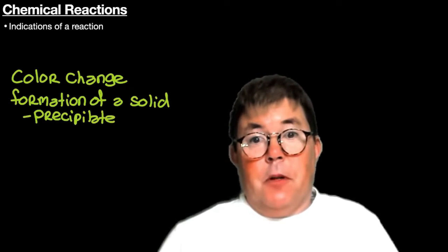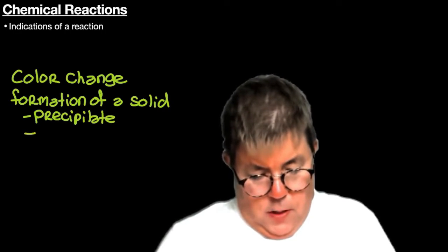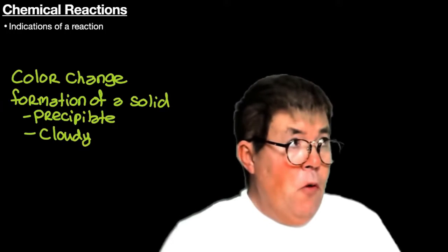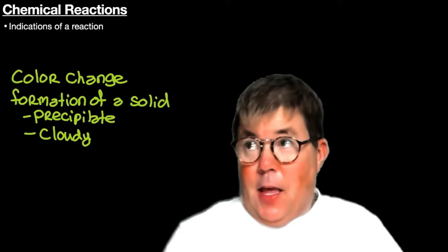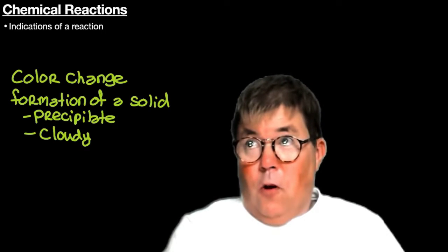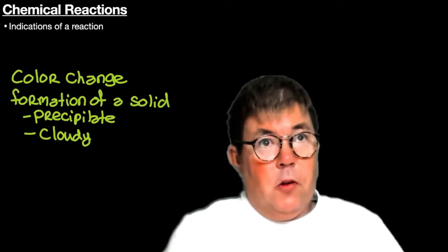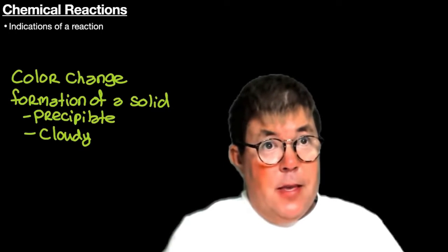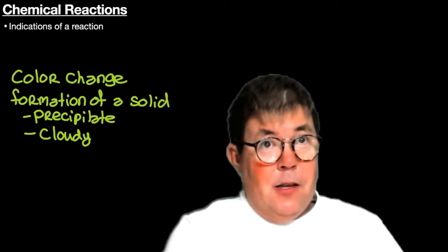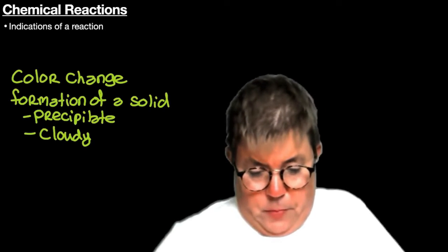How does a precipitate look? It's going to look cloudy. If we let a chemical reaction that has formed a precipitate sit for long enough, the precipitate will settle out to the bottom and we will see a distinct solid, similar to how sand settles at the bottom of water.